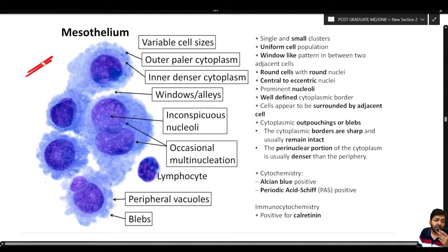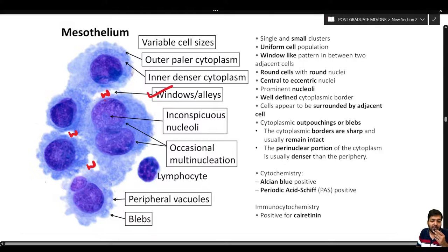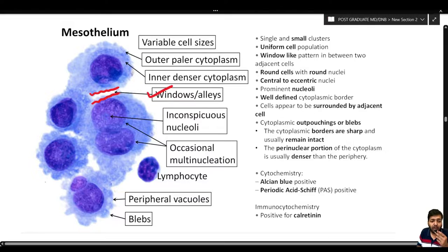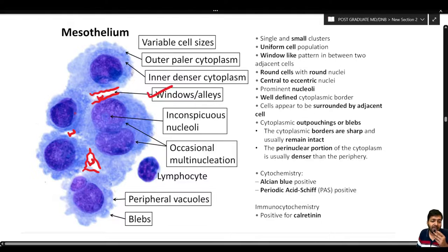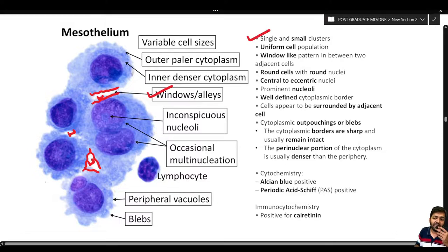One very important feature demonstrated by the cluster of mesothelial cells is the window phenomenon or window-like pattern. Between adjacent mesothelial cells there is a potential space or window. This occurs because the surface of mesothelial cells has microvilli, preventing adjacent cells from opposing tightly, so a space is always left — this is the window-like pattern, suggestive of a benign mesothelial cell cluster.